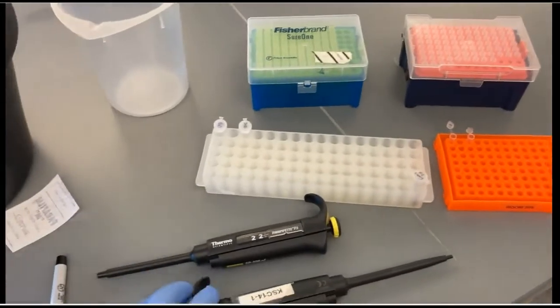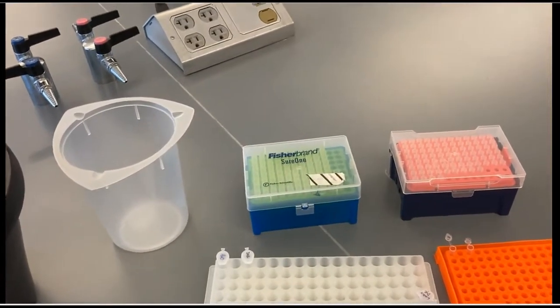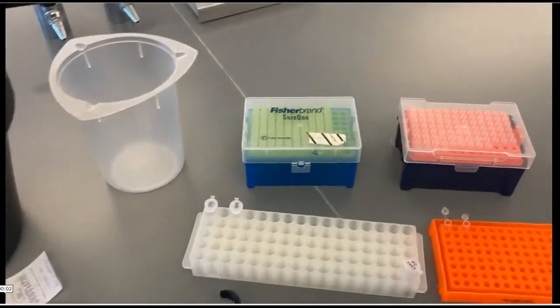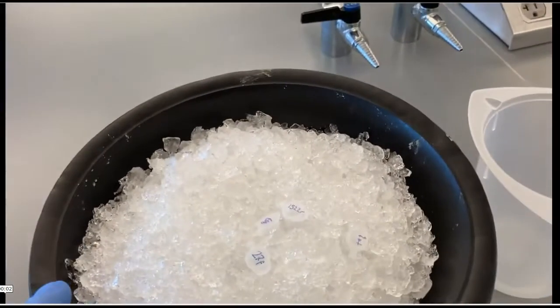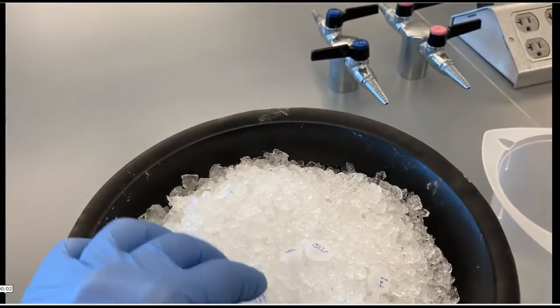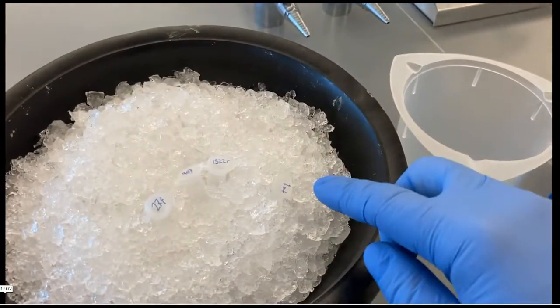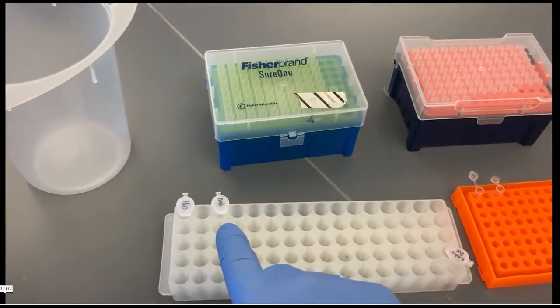We have two different micropipetters with two different volumes along with the corresponding tips. We also have several tubes of reagents for the PCR reaction. On ice we have the primers 27F, 907R, and 1522R as well as the TAC. And then at room temperature we have the water and the DNA.